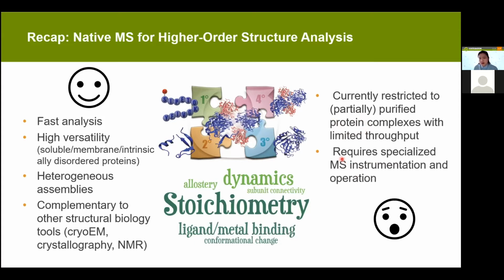And the other thing is becoming less of a problem right now. It used to be restricted to some academic labs to do this kind of analysis because it did require specialized instrumentation and operation. But now, because of the commercialization and the great efforts by the mass spectrometry vendors, a lot of the processes have been streamlined.